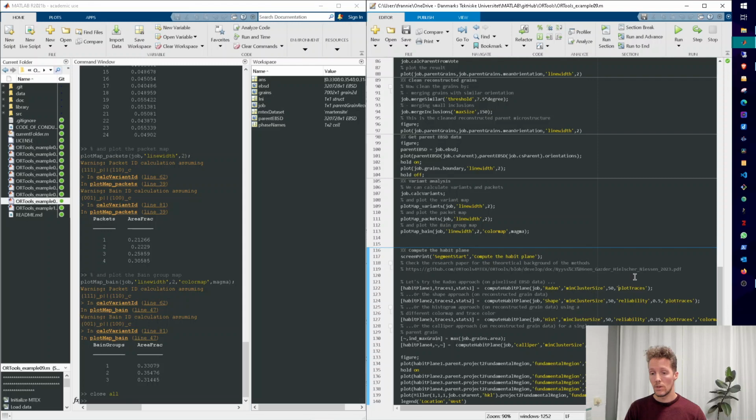Mind you, especially when we're looking at the pixel-based algorithms, the plotting is a lot. So if you're interested in looking at your results, plotting is encouraged. If you want to do this more routinely, I would actually leave out this parameter to speed up your calculation. So what we do is we just mark this, push F9, and then we wait for it to finish.